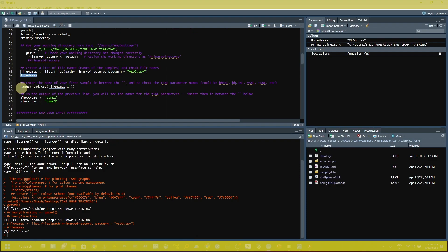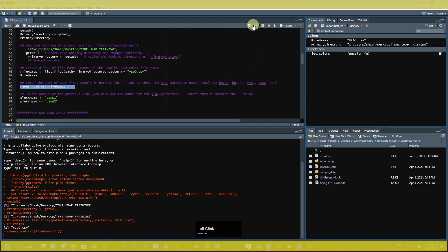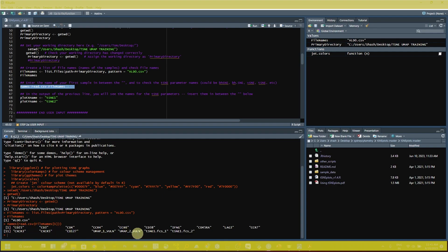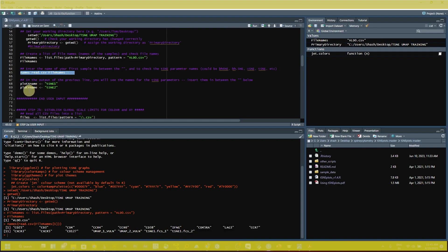Now follow all the other commands they have mentioned, like the 'names' command. This command is used to see the column names or variable names in our data file. You can see in the console window all the markers are available in this VLD0.csv file, along with the UMAP and t-SNE parameters. The next step is to set the plot x name and plot y name — this is very important.